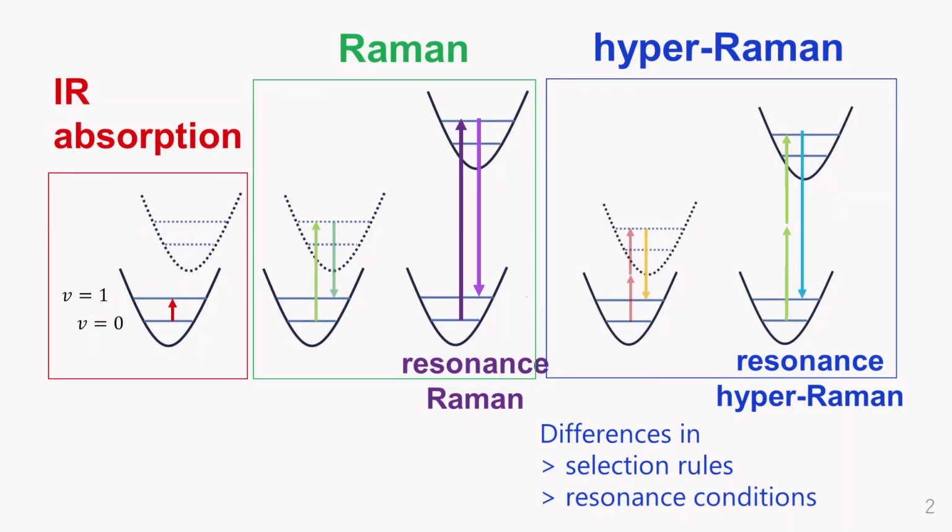In the case of Raman scattering, we irradiate the light, then a scattering process occurs, the propagation direction of the light changes, and sometimes the wavelength changes. So we have the excitation wavelength and the scattered light. The energy difference between these two lights corresponds to the molecular vibration.